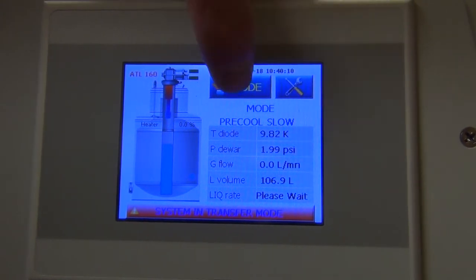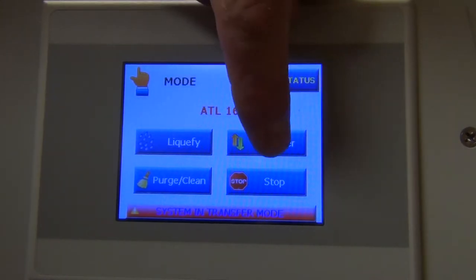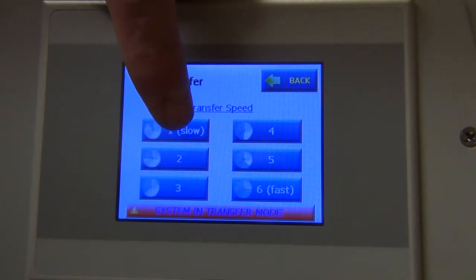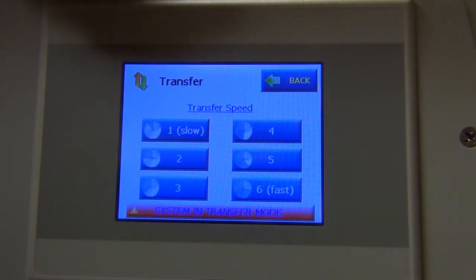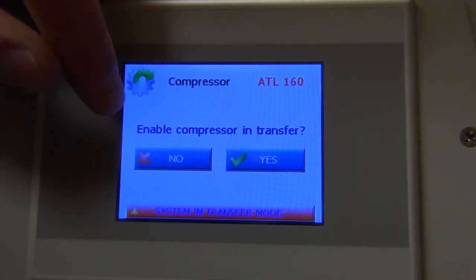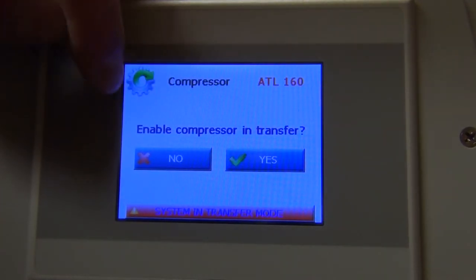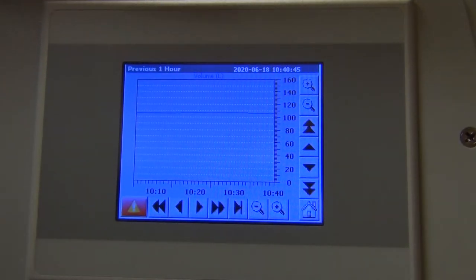We want to do a transfer, so we go to the transfer option. You want to start your transfer slow — the setting goes from one to six in increasing speed, which increases the pressure in the ATL 160 to push the liquid helium through the transfer line. So we start on slow, then the system asks whether to enable the compressor in transfer mode. We'll say no to keep it quiet. That will automatically bring up the tracking screen, showing the level of liquid helium in the Dewar as a function of time.